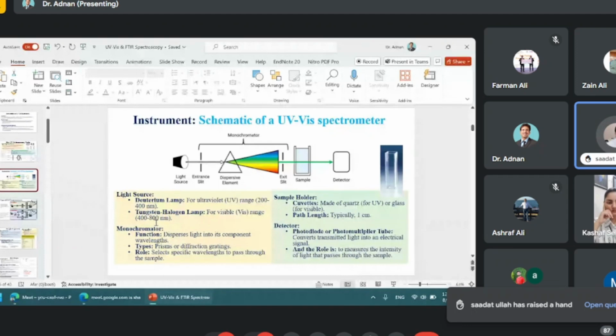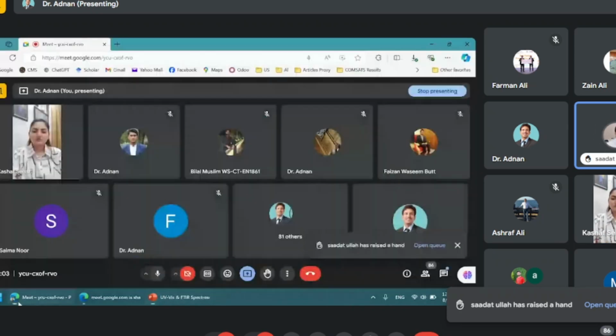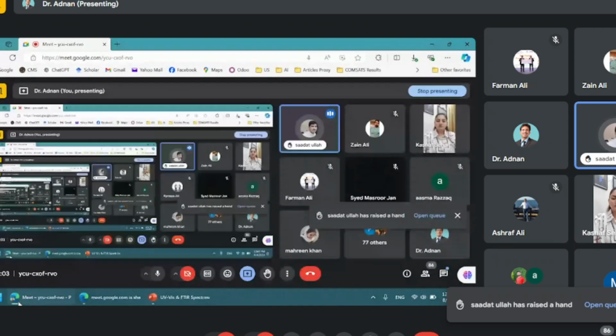Now we are doing dilutions because it is out of the range of the UV. Normally we take 1 ml of methylene blue solution and put 1 ml of water, and now the absorbance comes below 2. Then we multiply it by the dilution factor. My question is: if we do it with dilutions, will the concentration be the same or different?